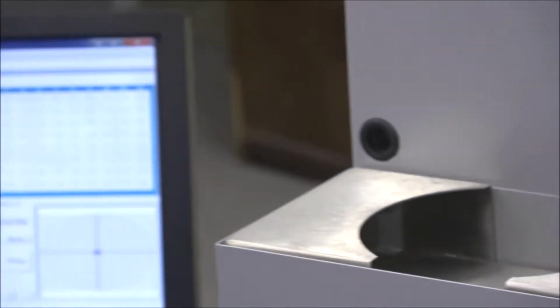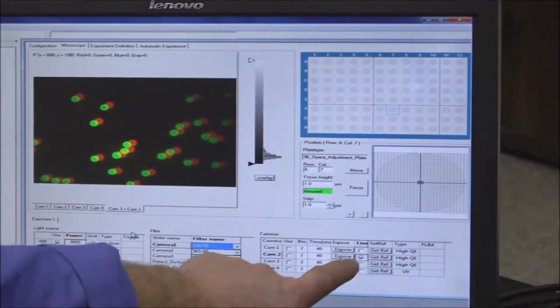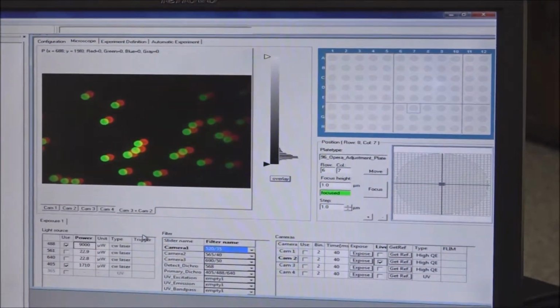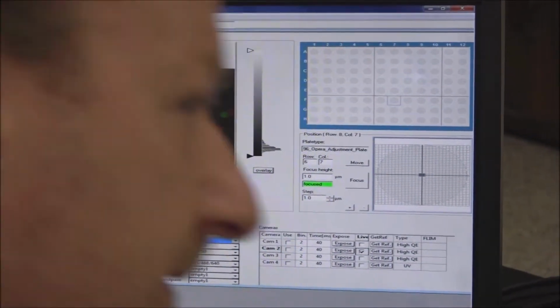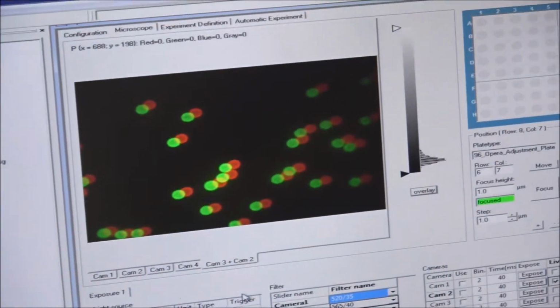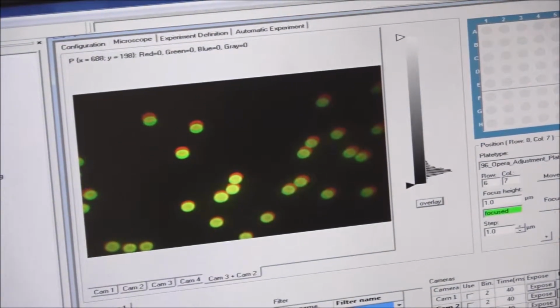Yep, I forgot I gotta switch to camera number 2 here. There we go. So I'm on camera number 2, and I actually tweaked it and moved it a little closer here. But I'm going to sneak back over here, and I'm going to make the adjustments. I'm going to have you get a screenshot so you can actually see while I'm moving over here. So when I'm moving the camera, you can see how that's aligning them there.